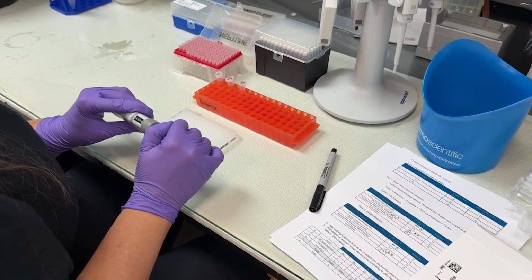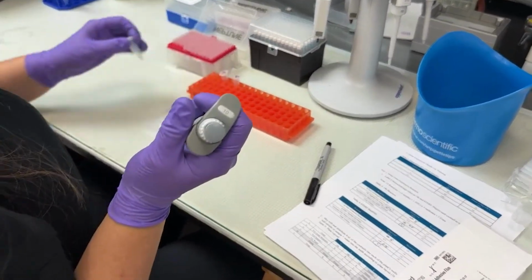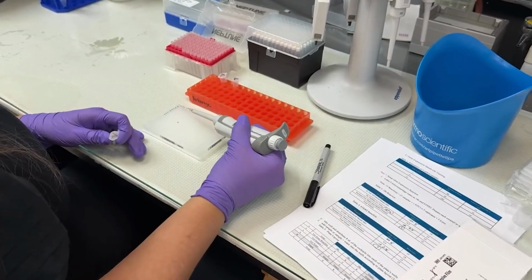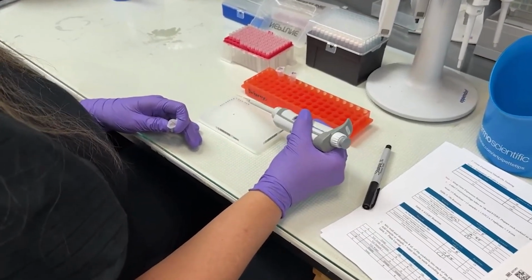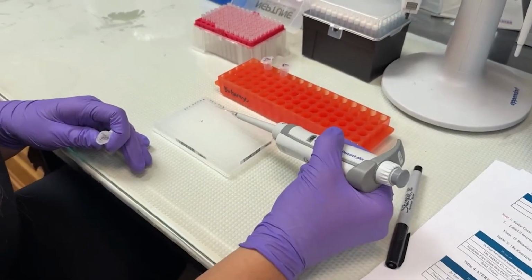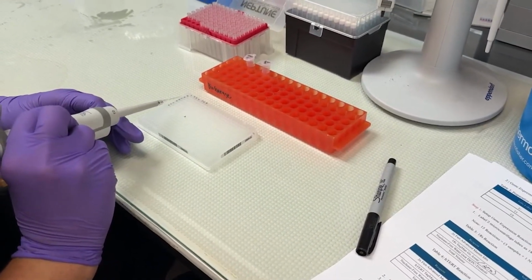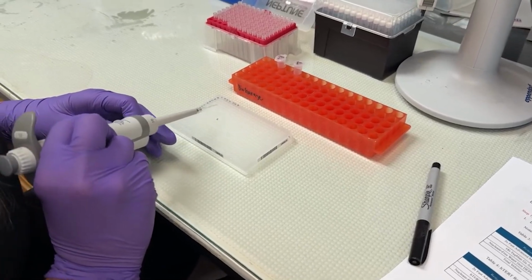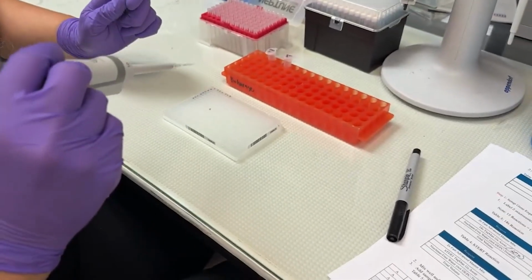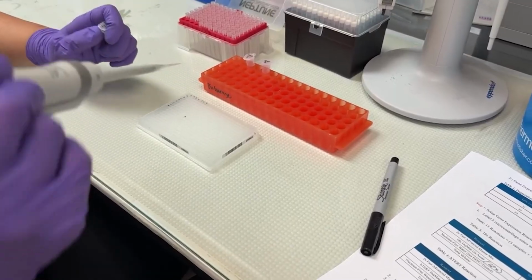I have 3 samples labeled sample 1. I know, creative. Sample 2 and sample 3, and then I'm going to add 1 of a no template control. So remember, I added the 18S reaction mix to columns 1, 2, 3, and I added the TERT to 5, 6, 7, and now I'm going to come back and add sample 1 in row A, sample 2 in C, sample 3 in E, and my no template control in G. So if we work out the rest of that matrix, I'll have triplicates represented for each of the 2 tests for each of the 4 samples.